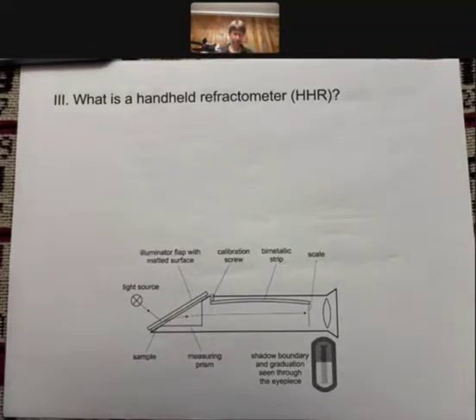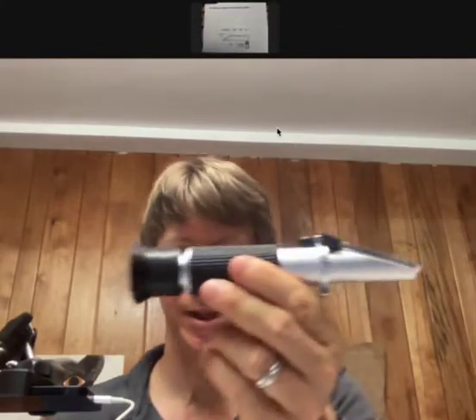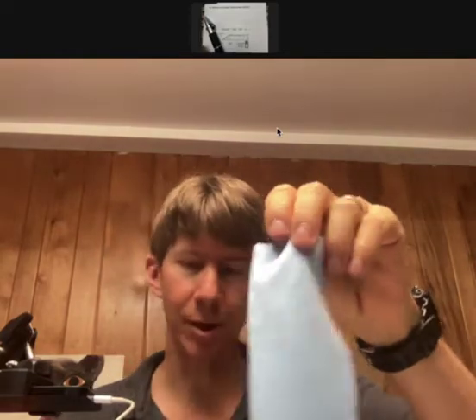Let's talk about what is a handheld refractometer. So this is a handheld refractometer. It comes with a pipette. It comes with a screwdriver for calibration. If you take off the underside foam or the topside foam, you'll also see the directions on how to use it, the operation manual, and a microfiber cloth.